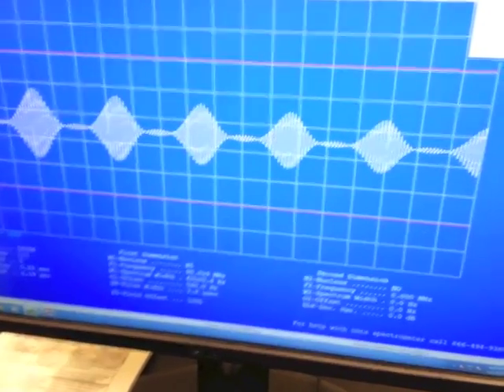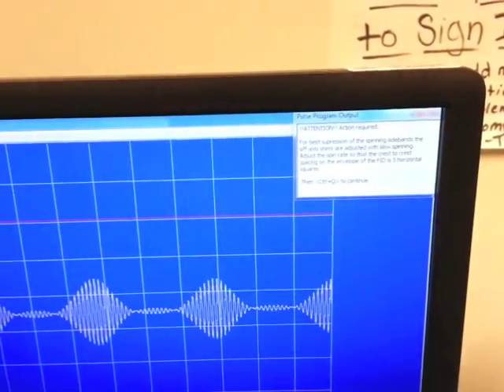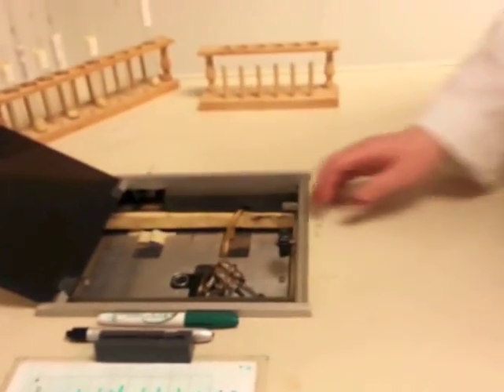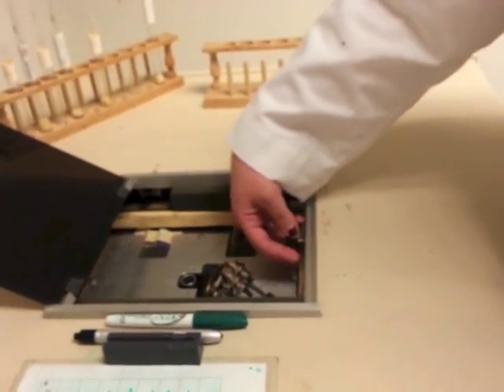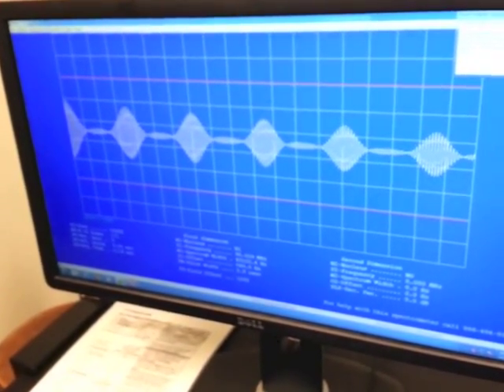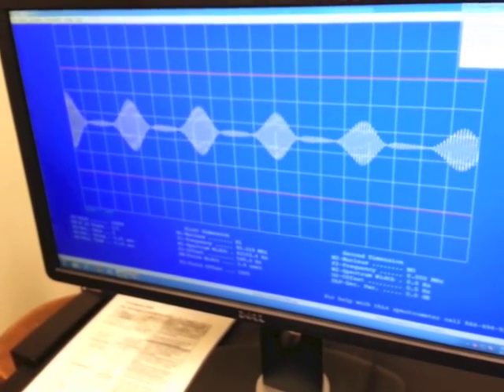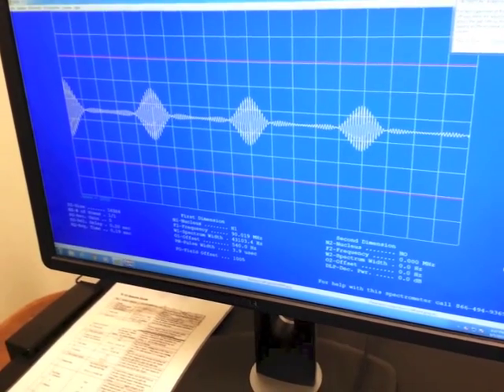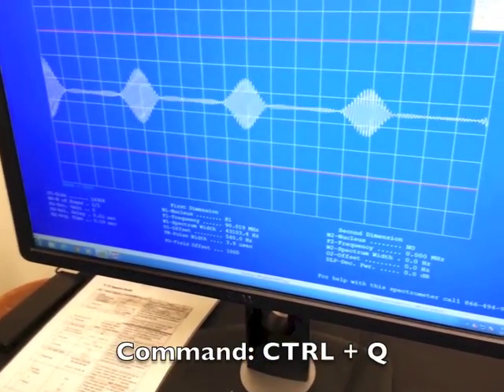Just like in the PREP routine, a box will pop up and it will ask you to adjust the spin rate so the peaks have five boxes between them. Once there are five spaces between each peak, come back over to the computer and hit Ctrl-Q.